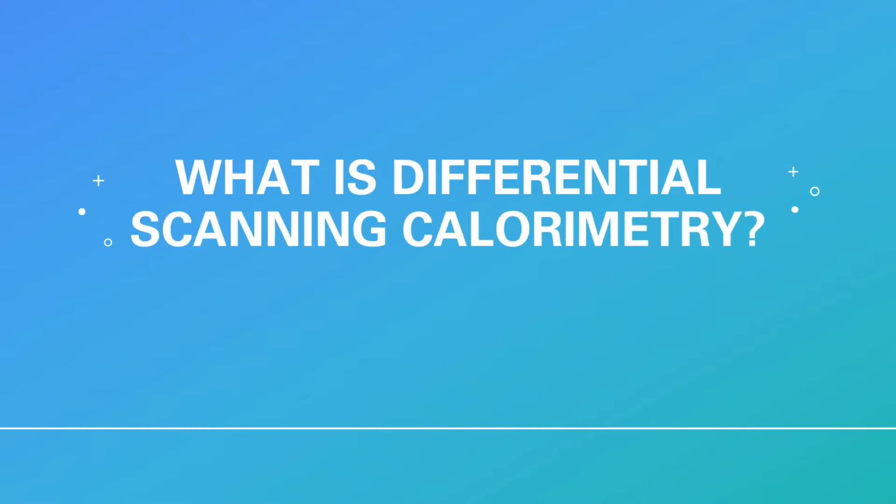Differential scanning calorimetry refers to the thermoanalytical technique in which the difference in the amount of heat required to increase the temperature of a sample and reference is measured as a function of temperature. Both the sample and reference are maintained at nearly the same temperature throughout the experiment. Generally, the temperature program for a differential scanning calorimeter is designed such that the sample holder temperature increases linearly as a function of time. The reference sample should have a well-defined heat capacity over the range of temperatures to be scanned.